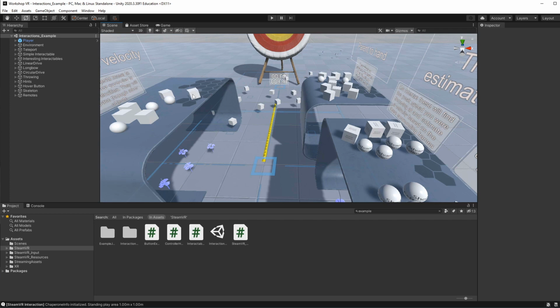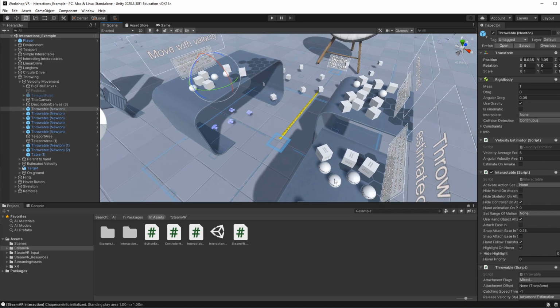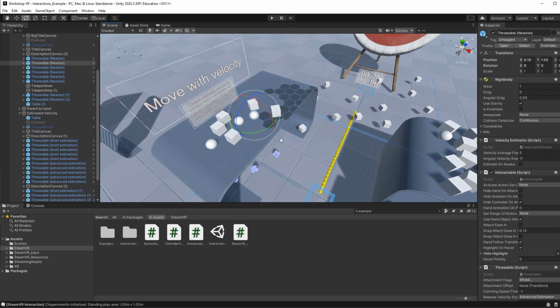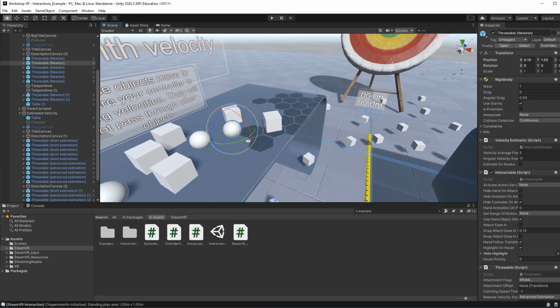a few minutes. I will go ahead and click on a game object, such as this sphere over here, that already has the behavior that I want my data model to have.